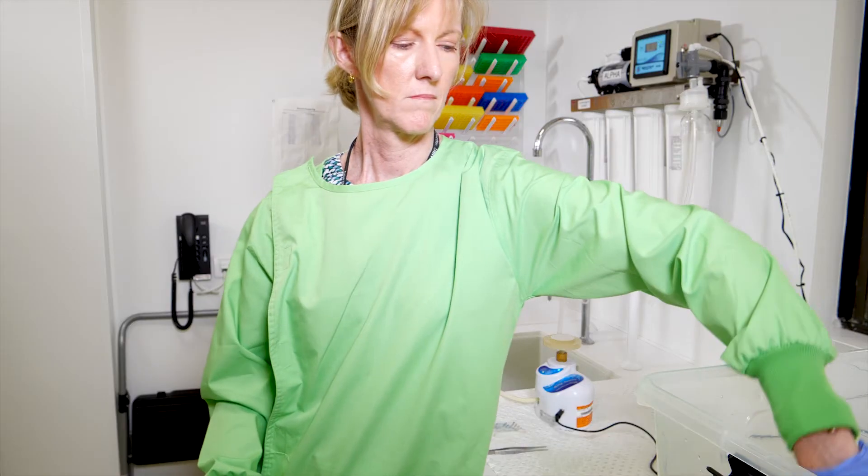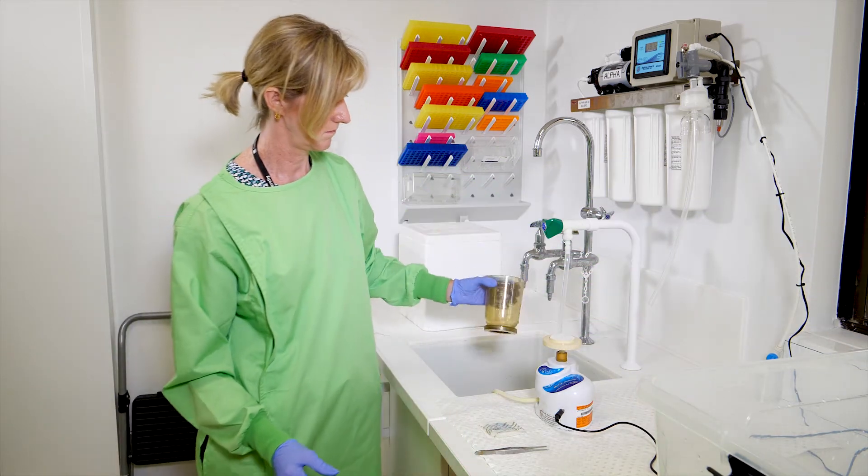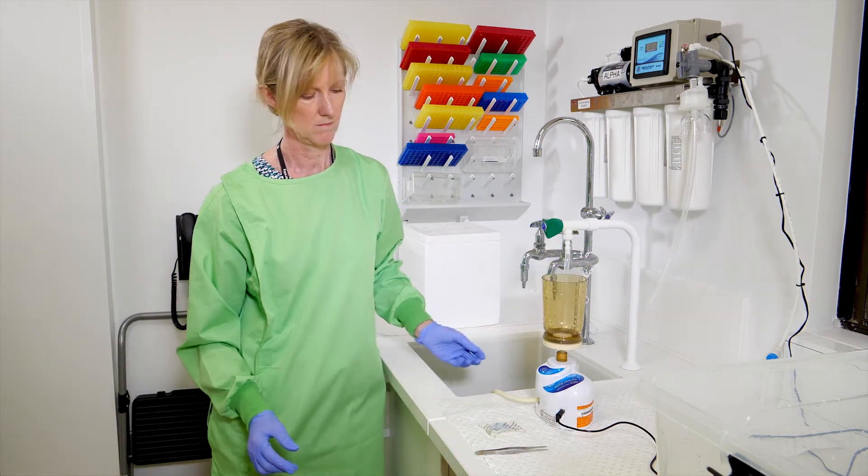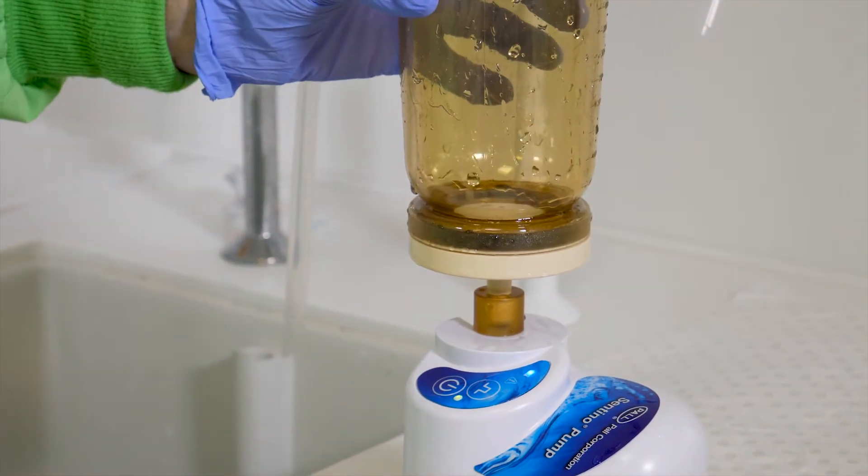Take the funnel out of the rinse water tub and place this onto the filter base. The filter base and funnel are magnetic, so you should feel a secure connection placement.